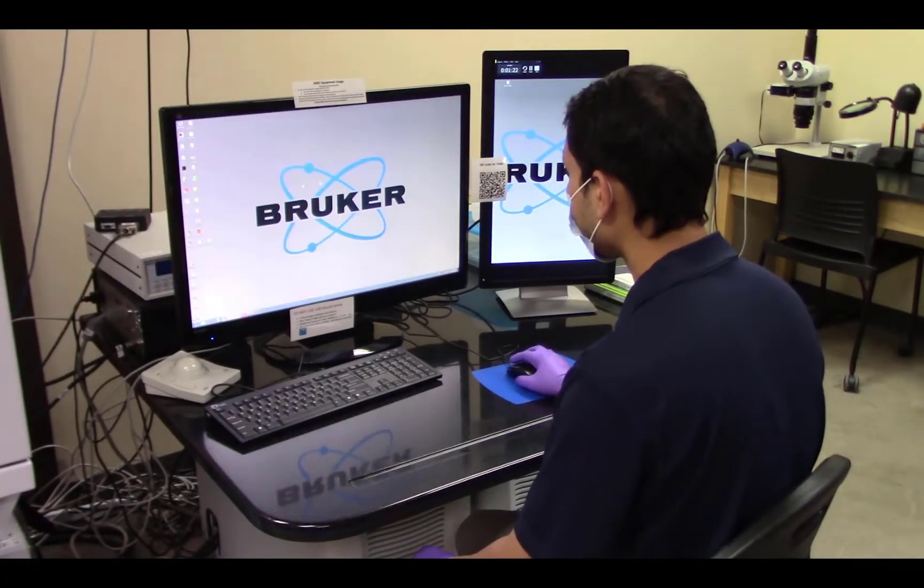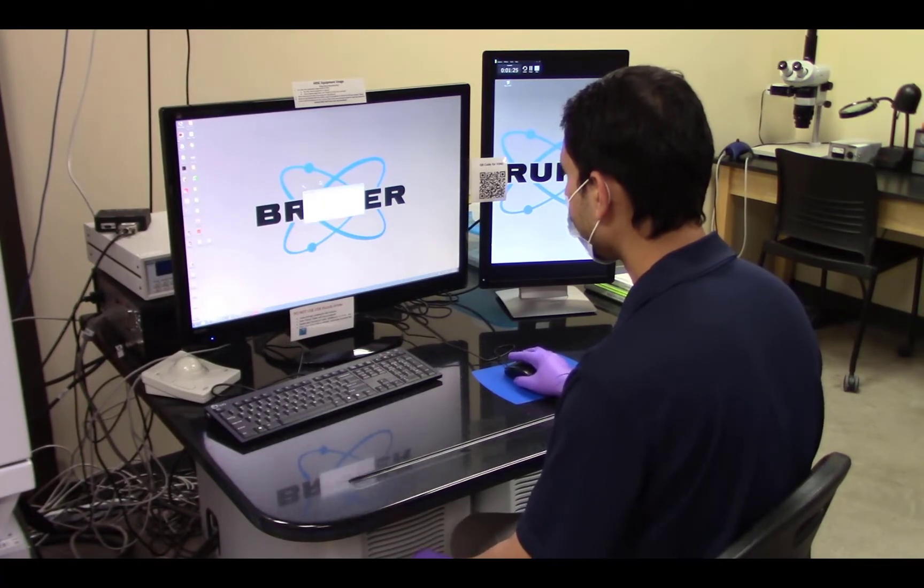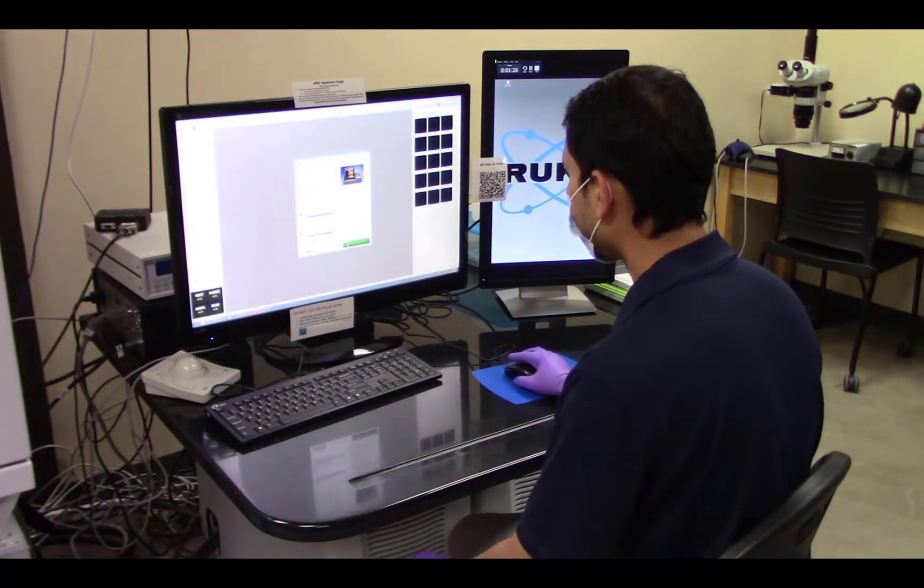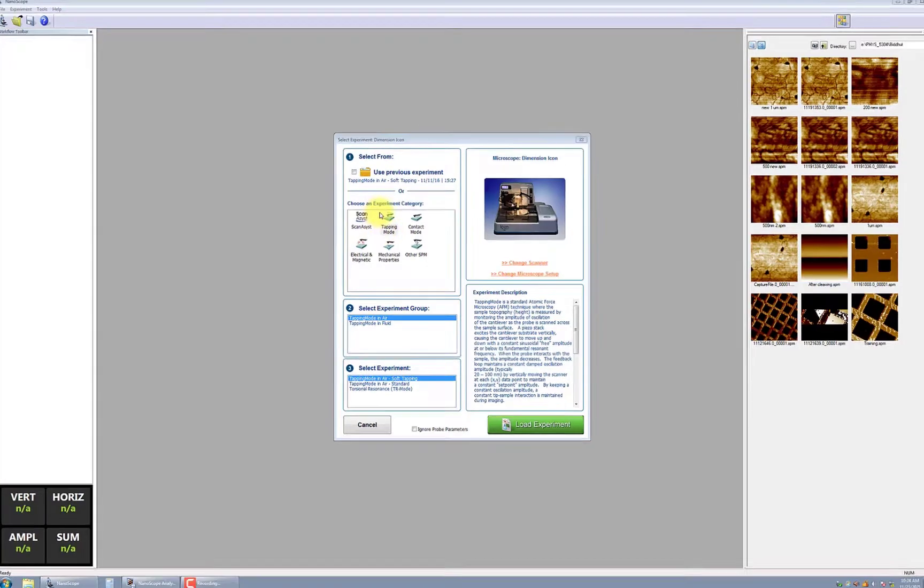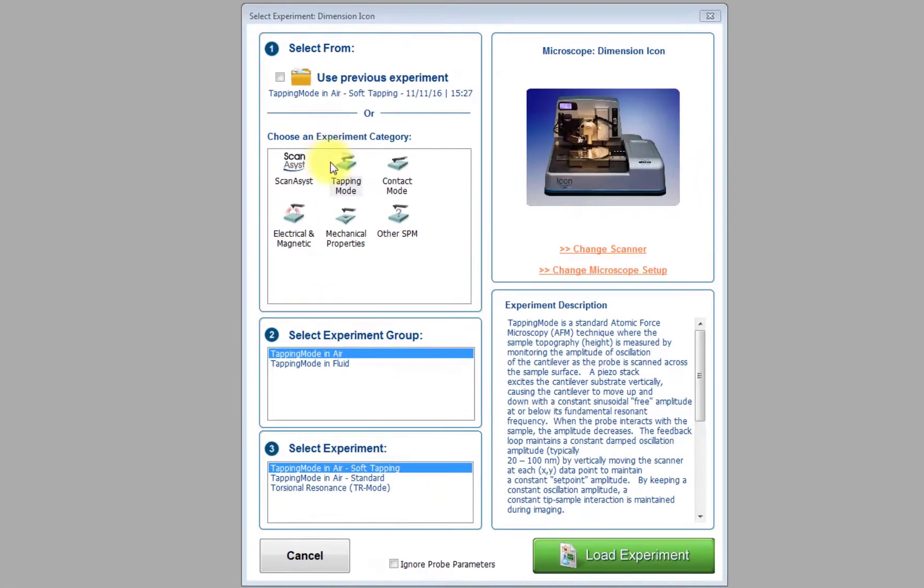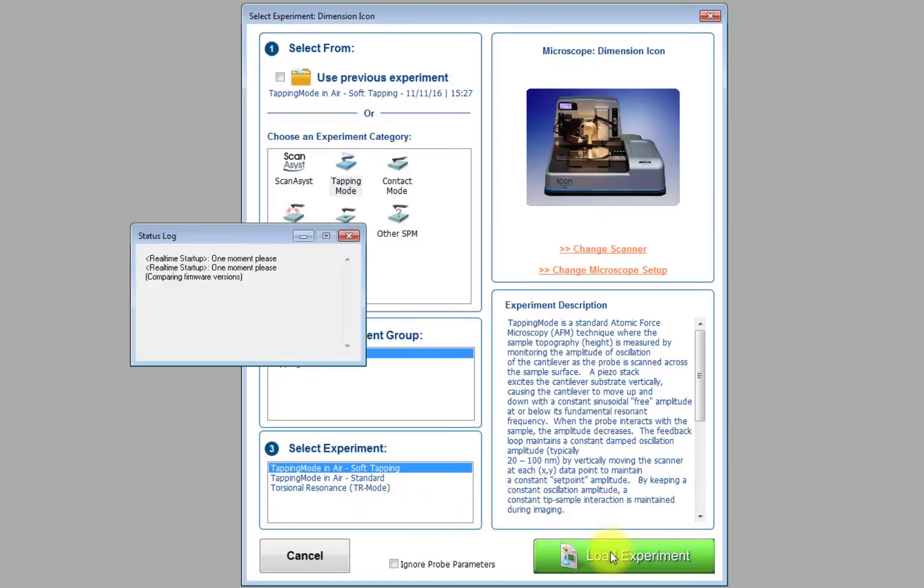Once the software launches, you will see a series of boxes to set up the experiment. In this case, you will select Tapping Mode in the top box, Tapping in Air in the second box, and Tapping Mode in Air Soft Tapping in the third box. Once those items have been selected, click Load Experiment.